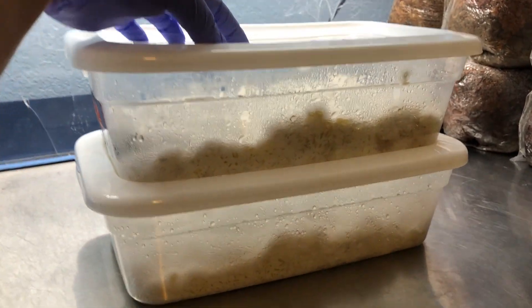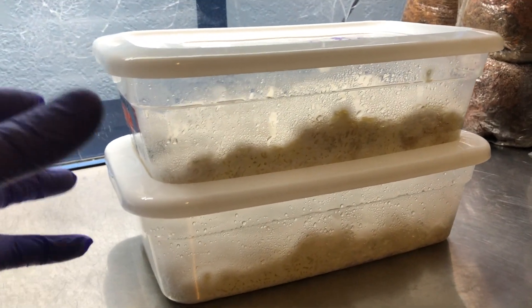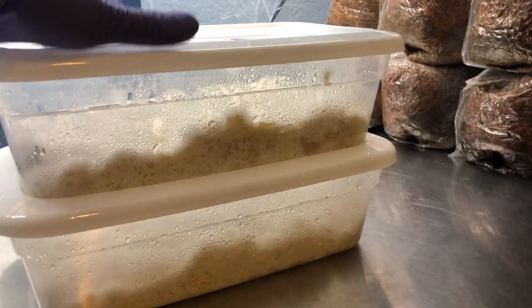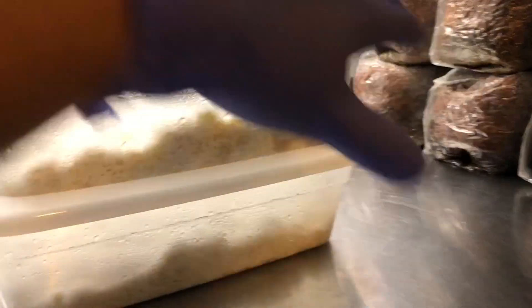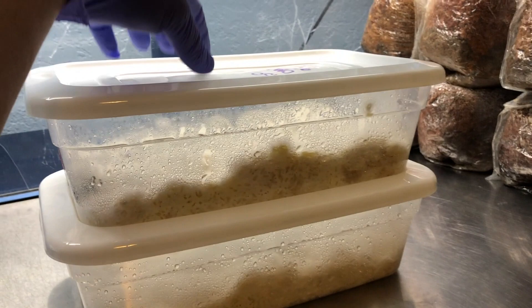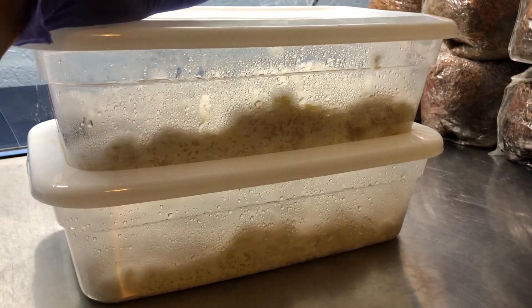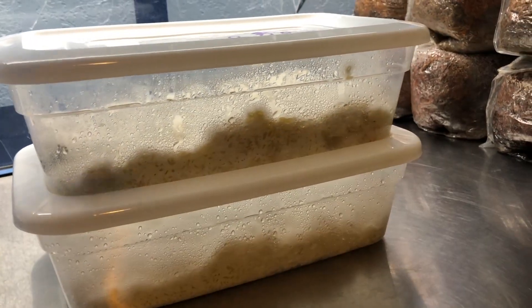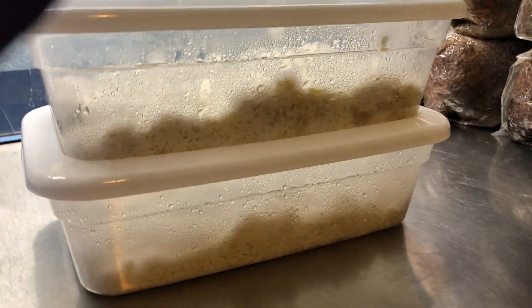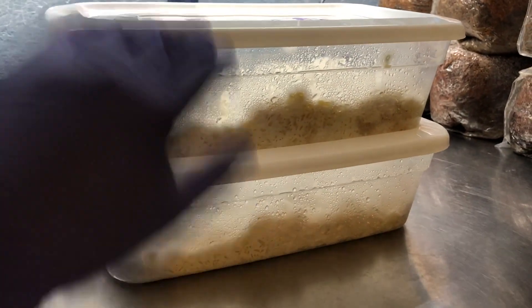My theory is that there's some kind of air displacement when I'm moving them. You can see the tub expands and contracts when I push down on the lid. The last time I moved these containers from the hood to my incubation area, I must have created a vacuum and sucked in spores. Be cognizant when handling your containers or grow bags — if there's any unfiltered air exchange, it's going to result in contamination.